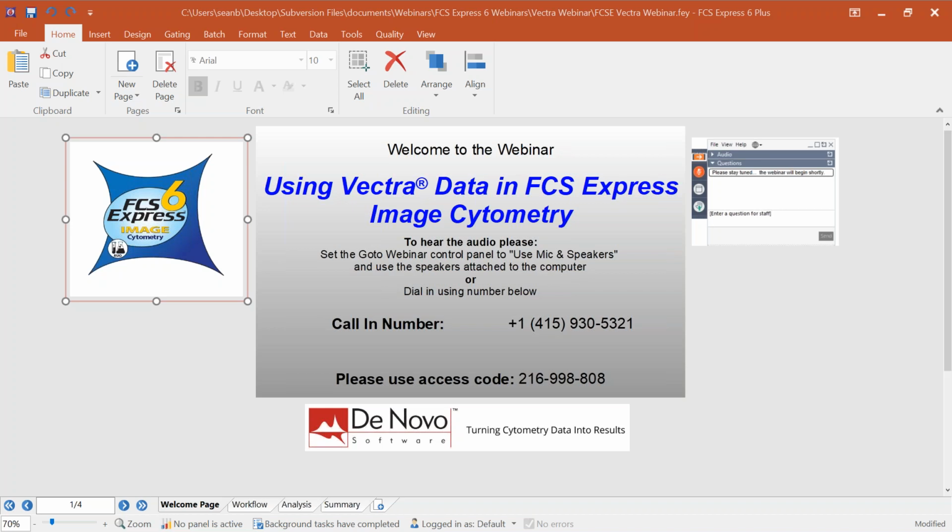It will be about half an hour to 45 minutes long, and we're going to give an overview of how FCS Express can help you analyze your image cytometry data generated from the Vectra line of instruments in the Inform software by PerkinElmer. So hopefully this webinar will give you a great head start on exporting your data from Inform software and taking advantage of the many features that FCS Express has to offer.